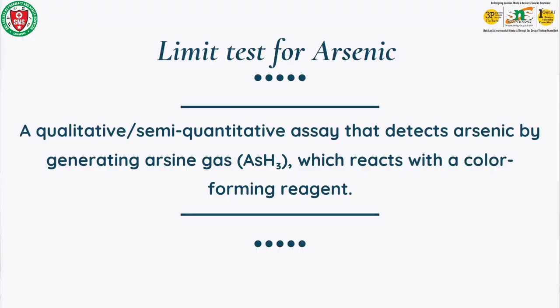Hi everyone. In this lecture, I'm going to briefly discuss the limit test for arsenic. Limit test for arsenic is one of the heavy metal limit tests, which is done to identify the presence of arsenic impurities in pharmaceutical substances or pharmaceutical products.